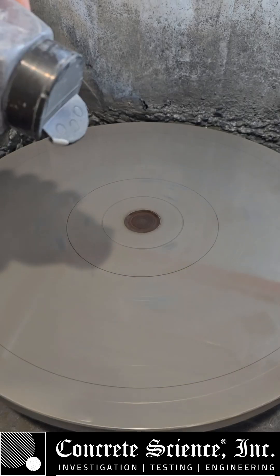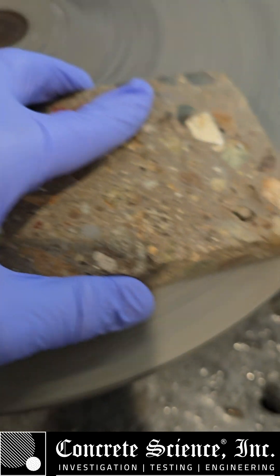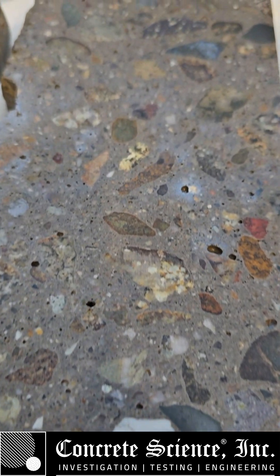600 grit. Alright, and that's 600 right there. Getting nice and smooth. 600 grit. Getting there.